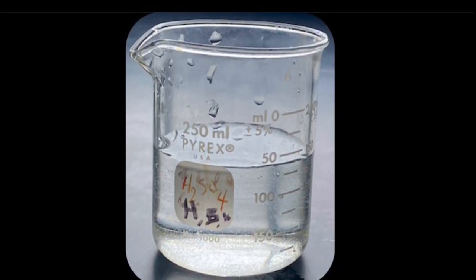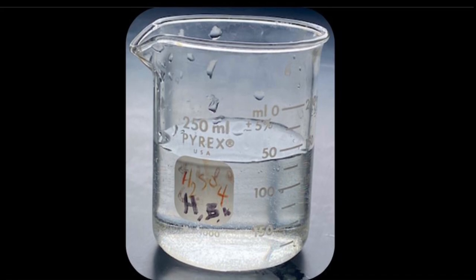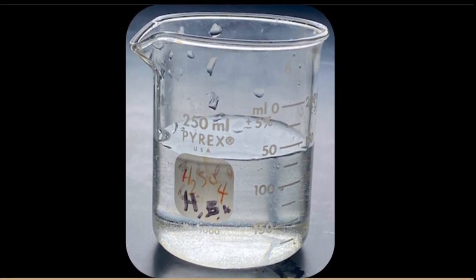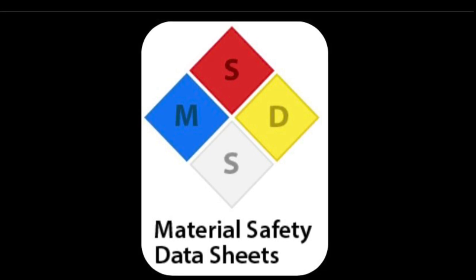Before using a beaker, ensure that you are aware of the chemicals that can be used within the particular beaker and ones that are not to be used. You can do so by reading the chemicals, protocols, and hazards prior to use.